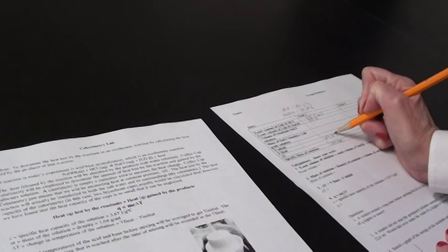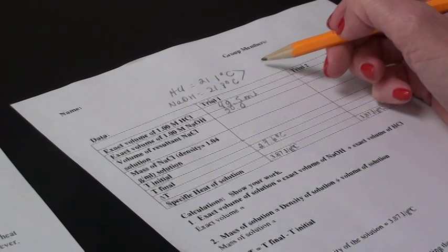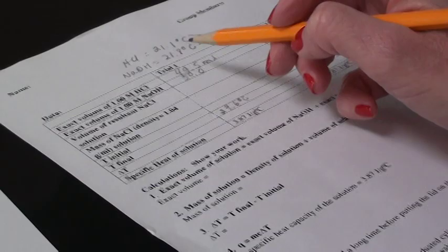I need to average these two to get my initial temperature. The average would be these two added together and divided by 2. It will go right here and then the volume would be these two added together.